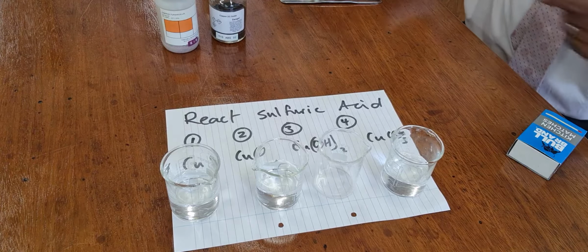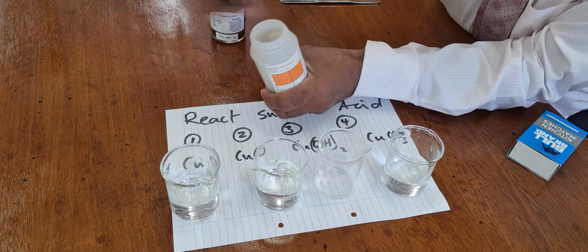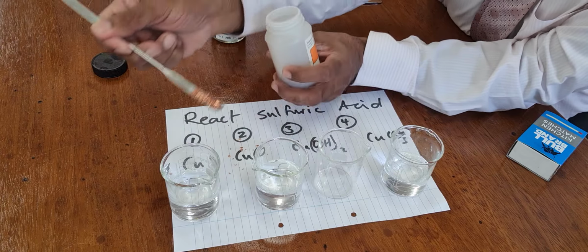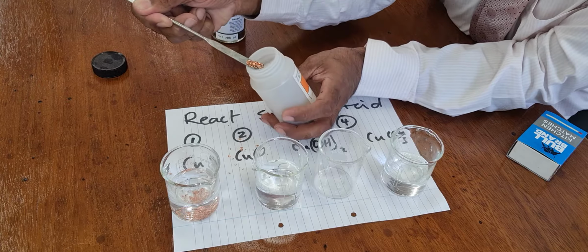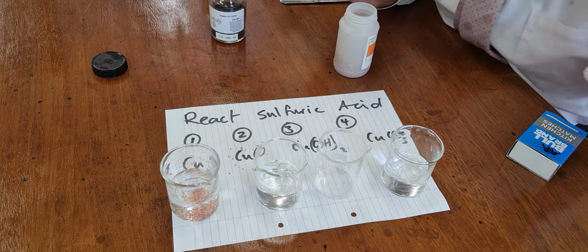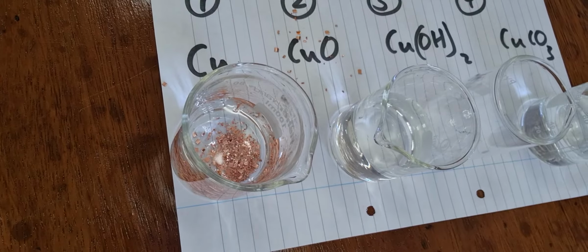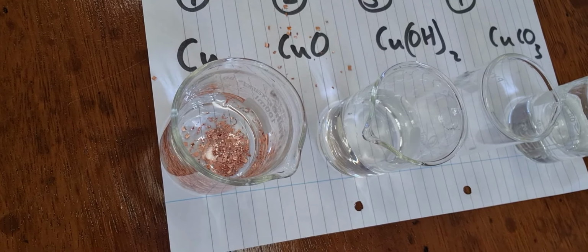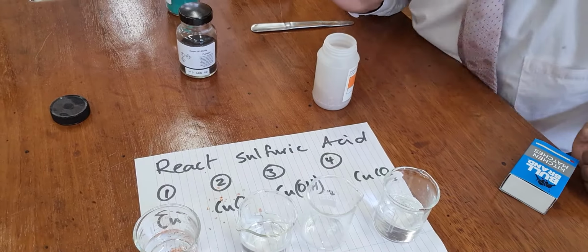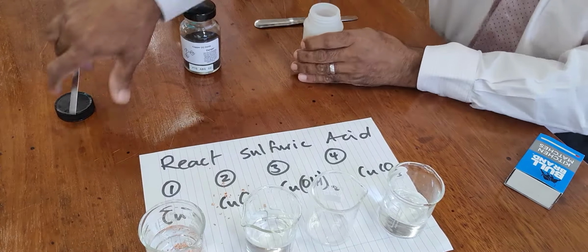Now let me show you a reaction. So copper first. Copper here. You see that? I can bring the thing a bit closer and show you perhaps. There's absolutely no reaction. So we can't use copper, can we? Let's try copper oxide.